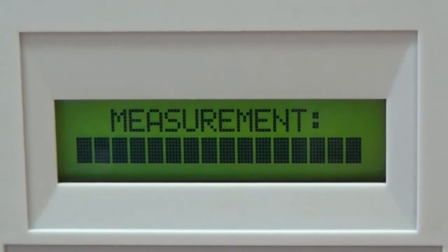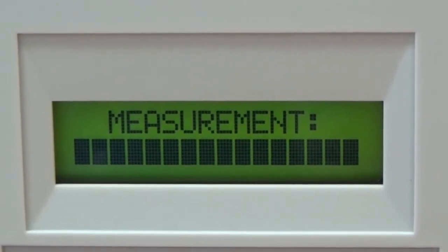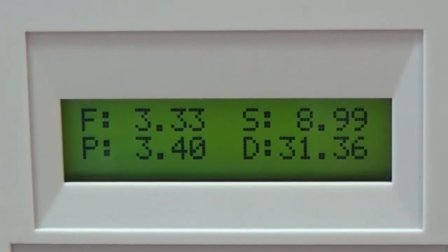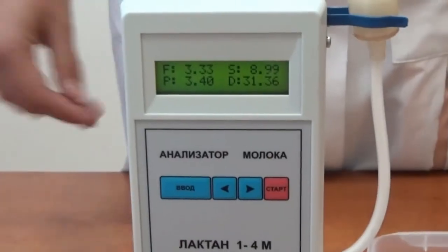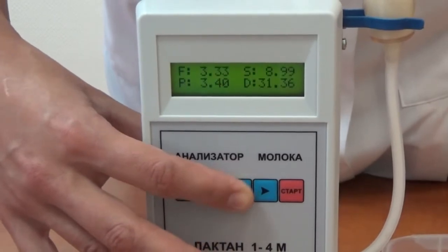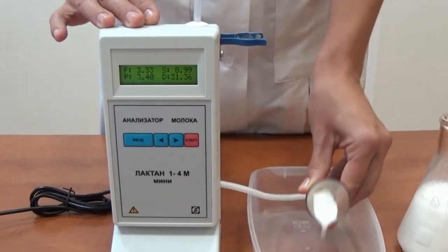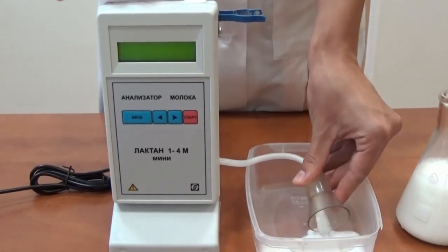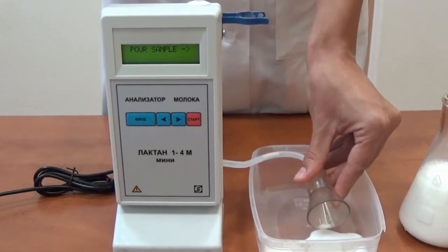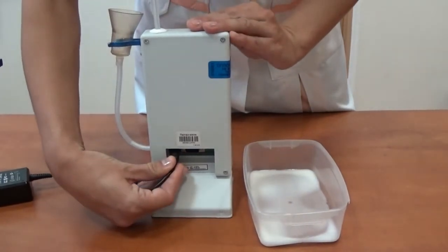Pour the sample into the funnel — the analyzer will automatically start the measurement. The message 'Measurement' and a status bar will appear on the display showing the total time of measurement duration. After the measurement is completed, the measurement results will be displayed. To see the value for the added water parameter on the display, press the arrow right or left button. When work with the analyzer is finished, it is necessary to clean the analyzer, as residues of milk in the measurement channel may lead to breakage.